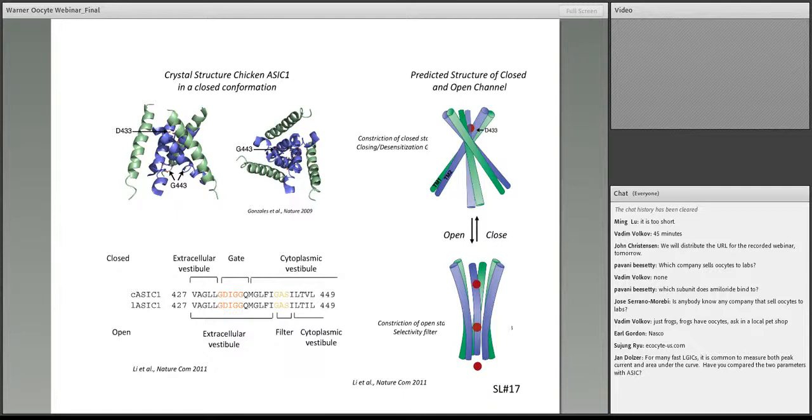Notice that the magnitude of the current here is less than 1 microamp, much smaller than in the previous examples, owing to the slower ion transport rate of transporters compared to ion channels.